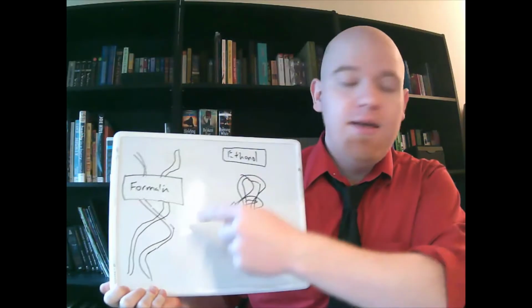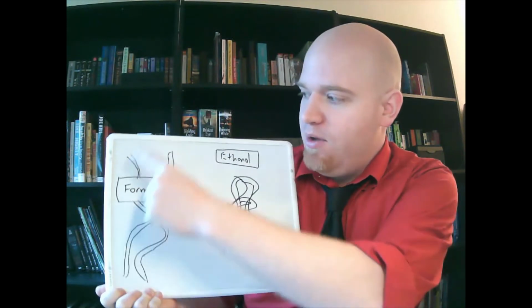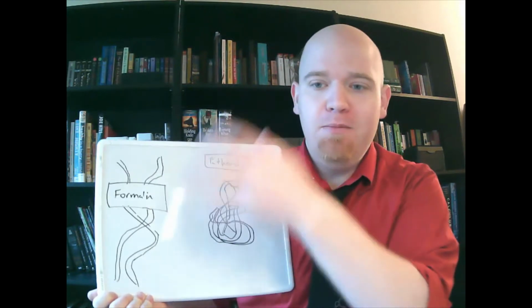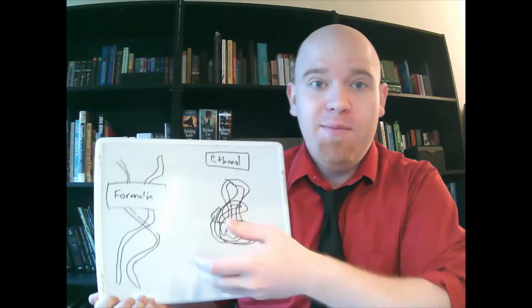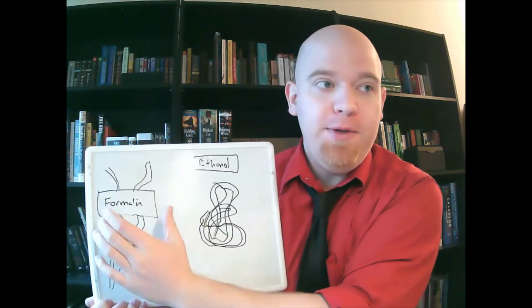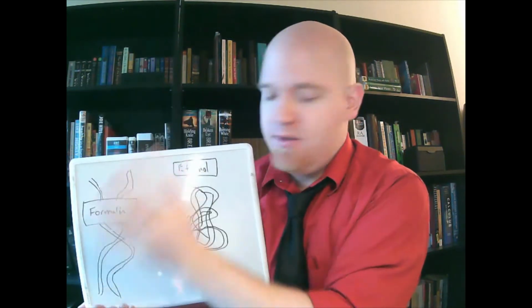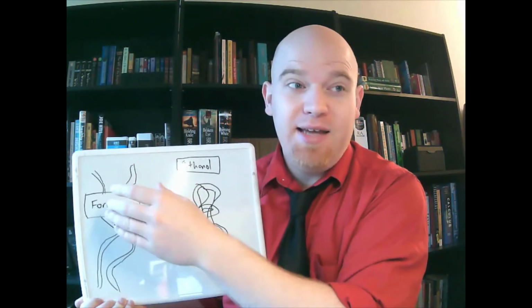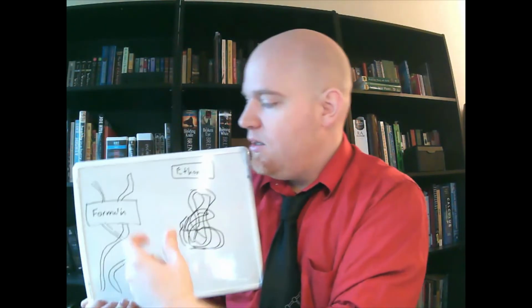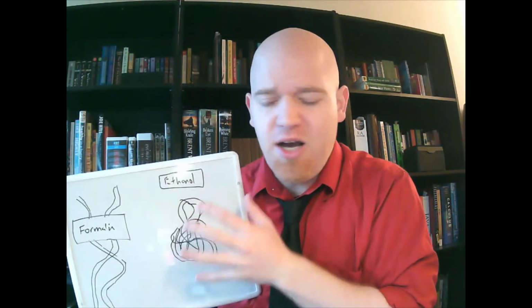As you can see, formalin kind of makes a band-aid. It's an additive, right? So you have these two strands of protein here that would just love to squiggle around and move. And the more they move, the less true they are to how they were in the body. So what formalin does is it attaches itself to those proteins and stops them from moving. Now, formalin can't attach itself to every protein type or every amino acid. So we have to use ethanol or alcohol to kind of finish the job.